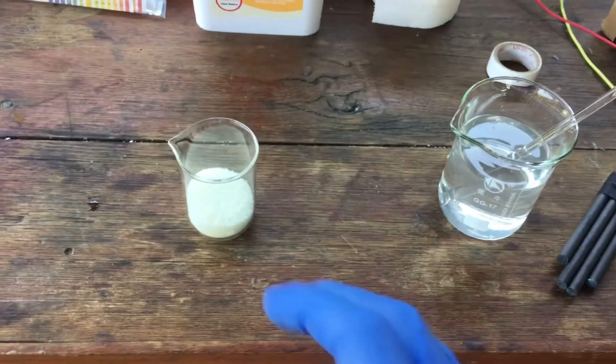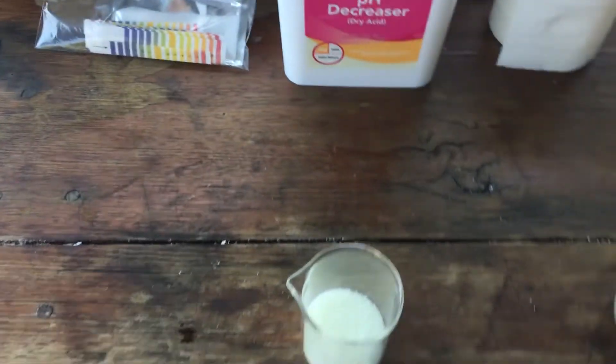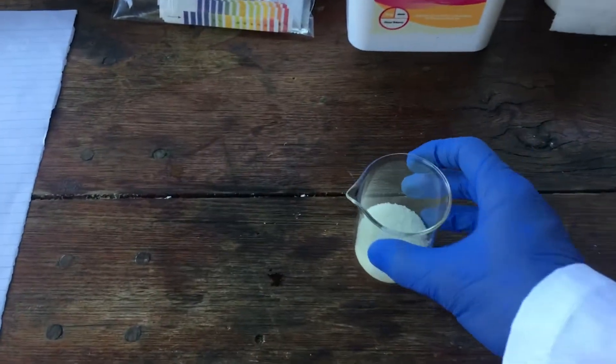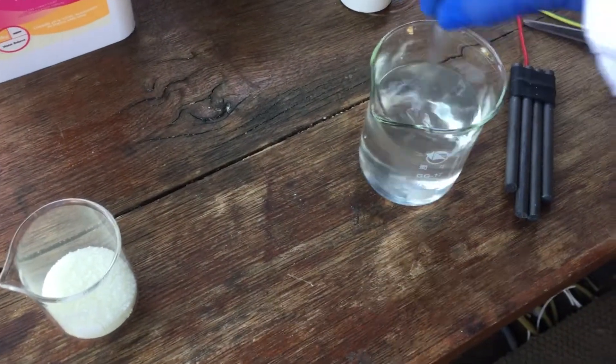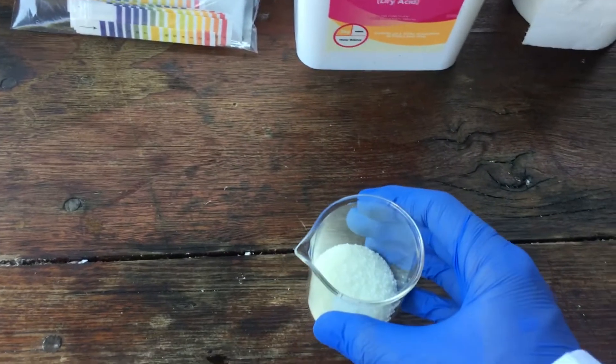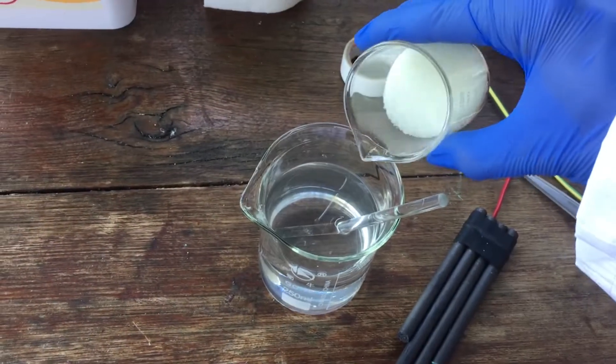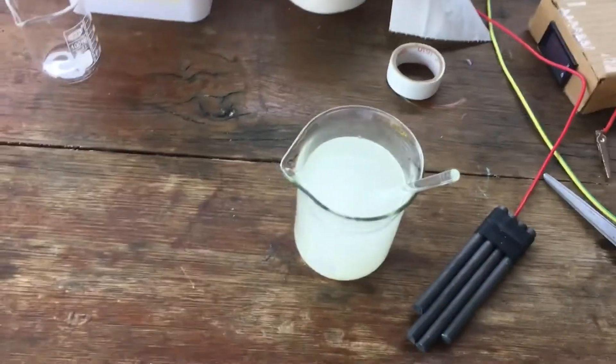What we also need is a stoichiometric equivalent of sodium bisulfate, the same number of moles of sodium bisulfate as we put in sodium bromide to begin with. So, for me, that's about 56 grams. Got a little bit of excess in here, and we'll slowly add that in. We'll leave that to dissolve and set up the power supply and everything.